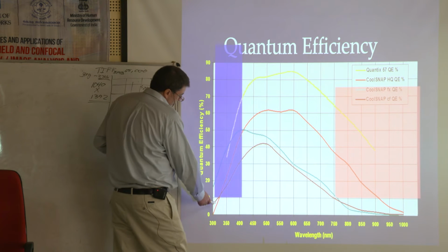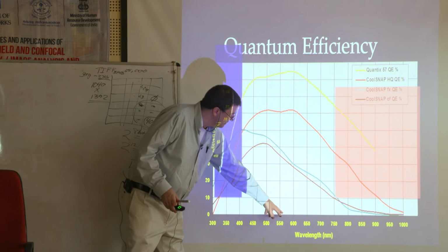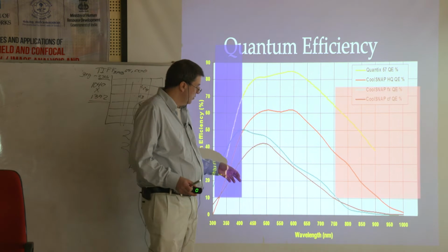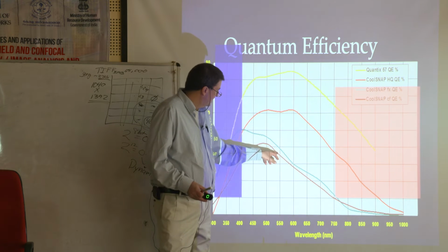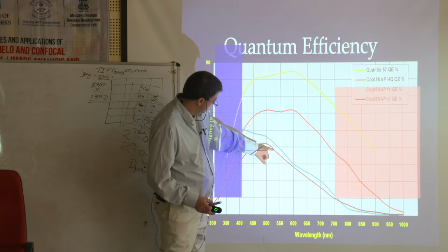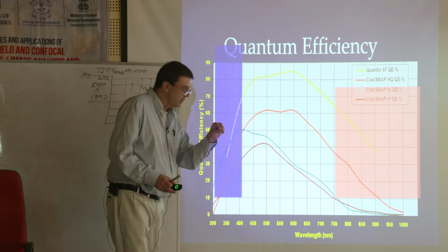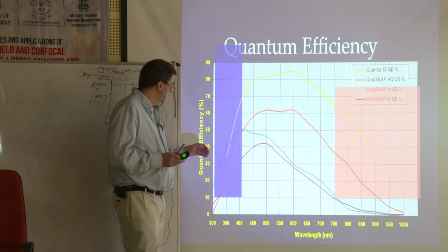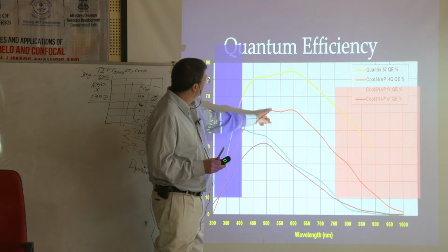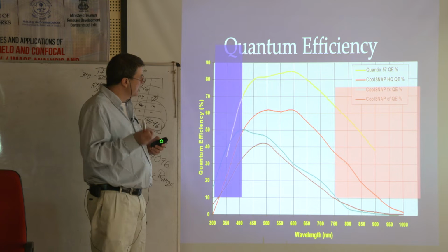Okay. So what this means, if we look at one of these low curves, around 500, 512. Like today we'll talk about a dye called Alexa 488. It tends to emit around 512 nanometers of light. So right around there, this particular camera has a quantum efficiency of about, oh, what would you say? Maybe just shy of 40%, right? So that means all the light you put in, it'll grab about 40% of it, the other 60-some percent will be lost. Okay, but if we had this camera here at that same number, about 512, we go up, we would get 80-some percent quantum efficiency. It's a much more sensitive camera. It's a much better camera.